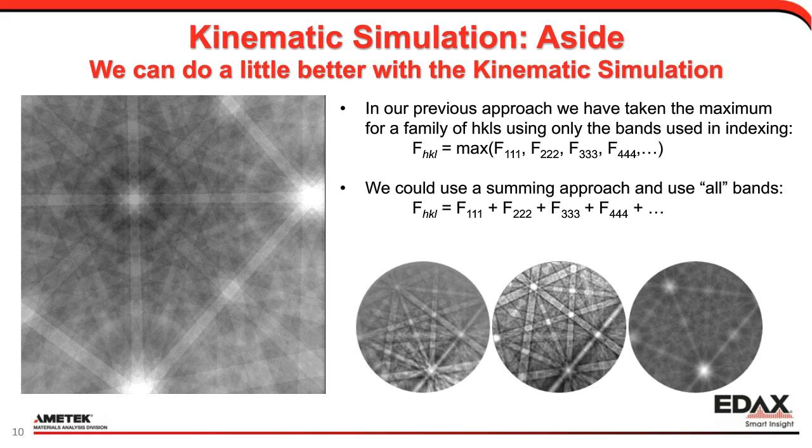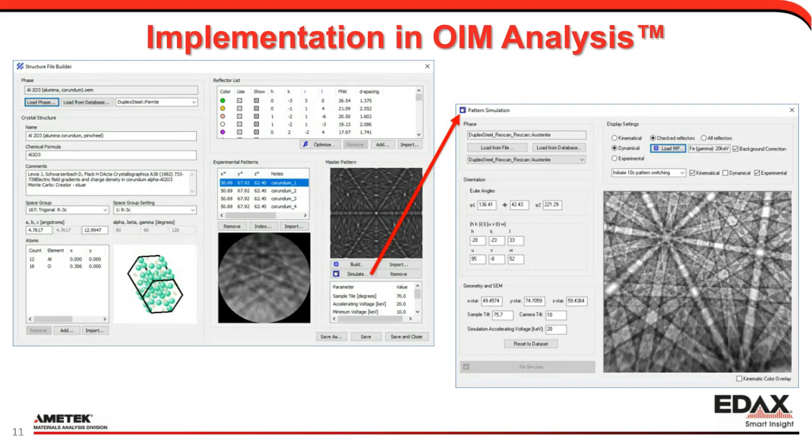So I'll be showing a few screenshots. We are implementing this in OIM analysis. This is new and it's subject to change as we polish it up and get it ready for release to our customer base.